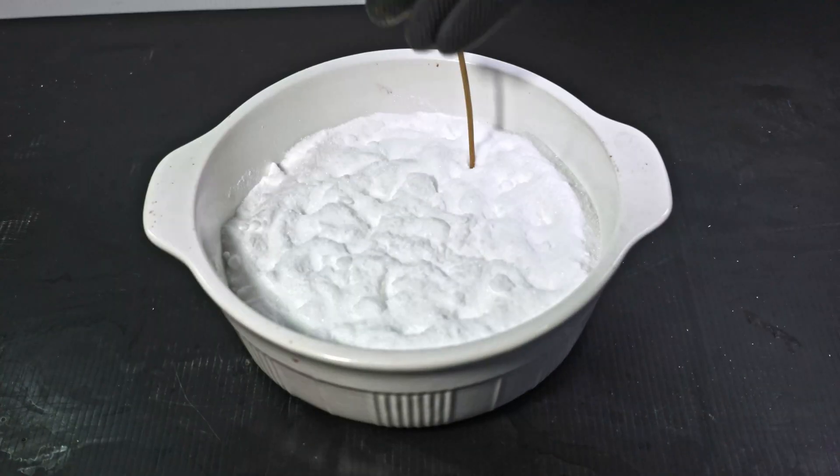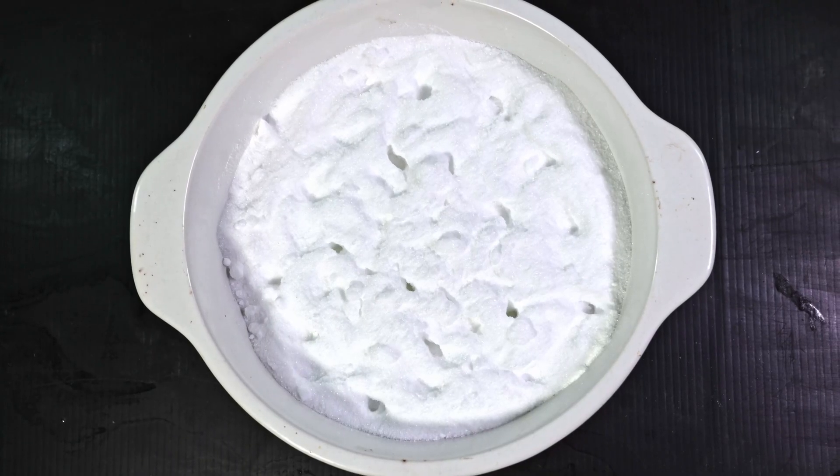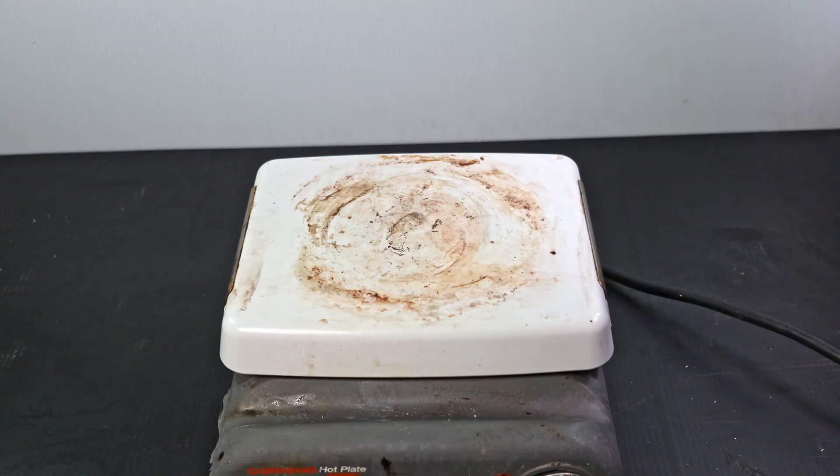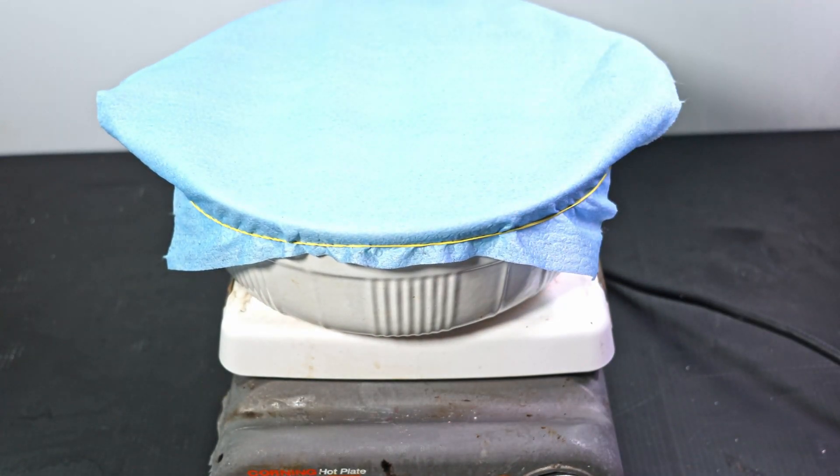I stirred it around some and poked holes to allow water to better escape. Finally, I put it on my hot plate with a cloth over to prevent contaminants from getting in. I set my hot plate to around 130°C, accounting for the ceramic slow heating and thermal loss.